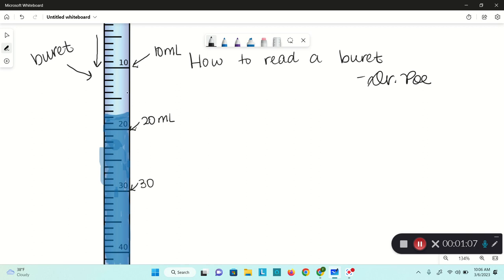We're always going to measure. First, we're going to look and see, here's our liquid, and where's our air? It should be kind of colorful. Just like measuring in a measuring cup.